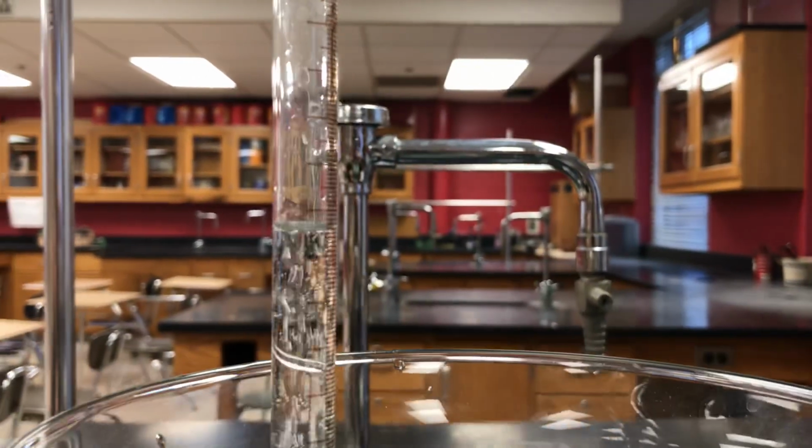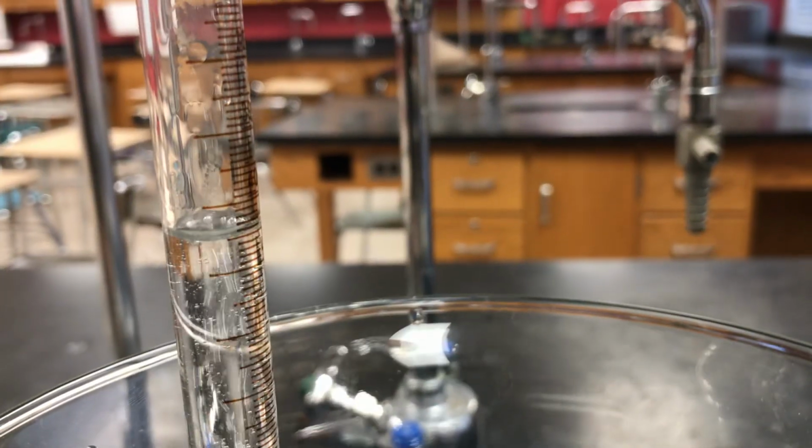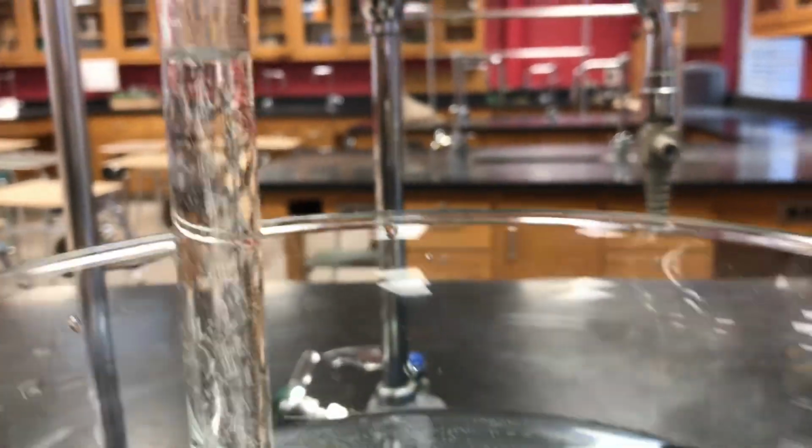And let's get zoomed in again. I think we lost our piece of magnesium. Did we? Either it's dissolved or it's somewhere. I don't know where it went. I don't see it. Still see some bubbles coming up. There must be a little piece trapped with some copper wire. The copper is not reactive with HCl, so it's a good holding material to use.